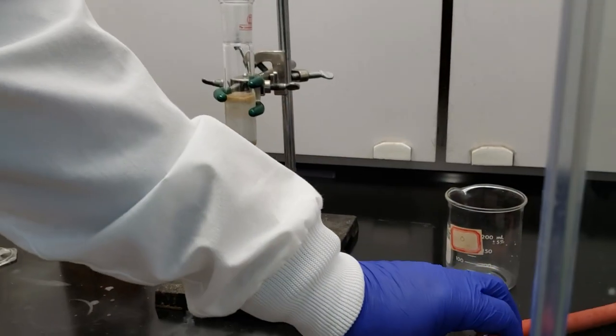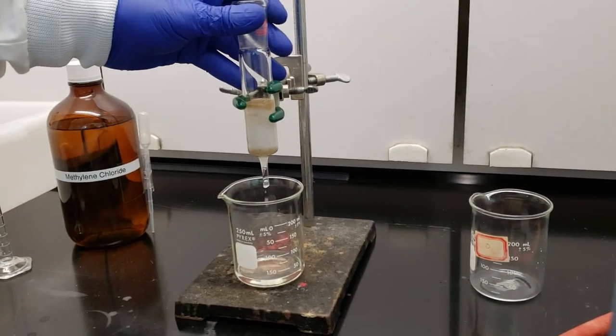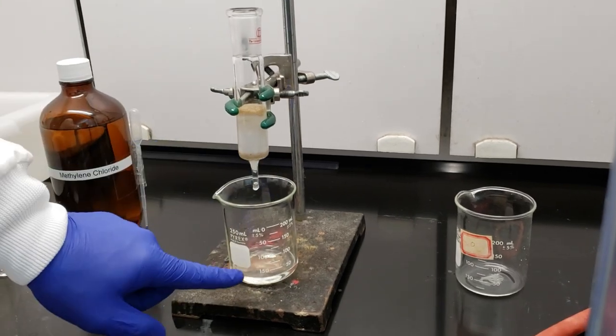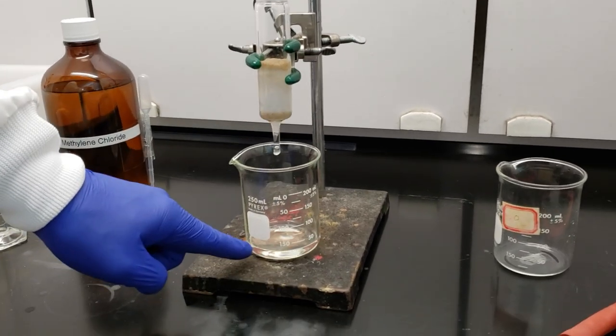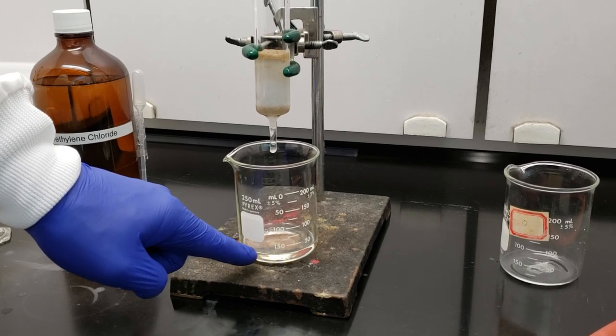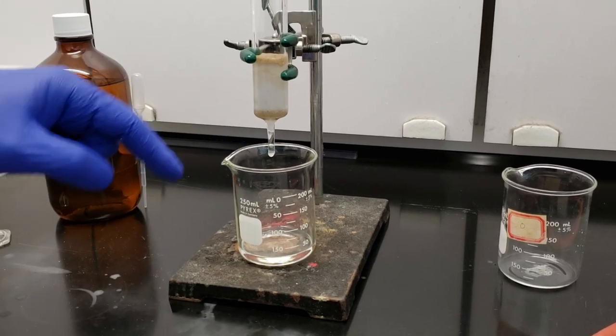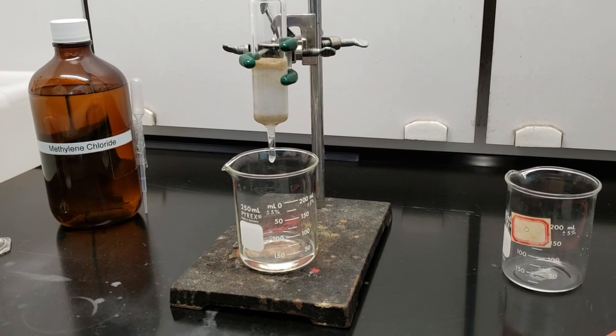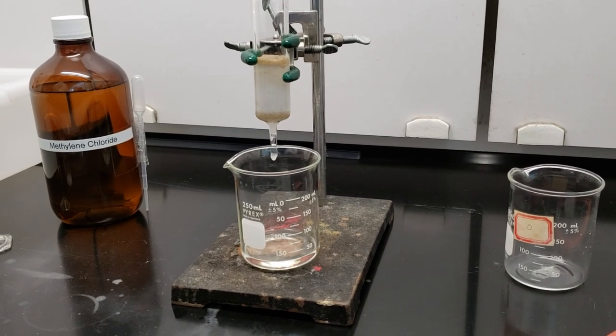So our solvent is drained down to the top of our sand layer here. We've collected our product in our beaker, pre-weighed. We have a mixture of diethyl ether and methylene chloride. We're going to let this last bit of solvent drop out, and we're going to transfer this over to a hot plate so that we can drive the solvent off and isolate our final product.